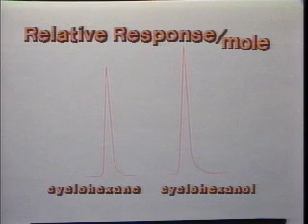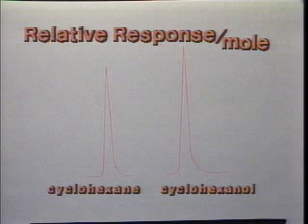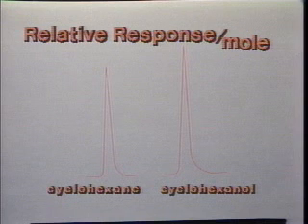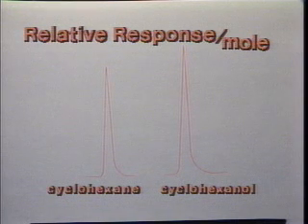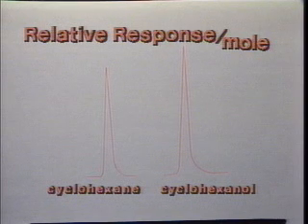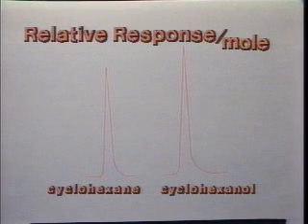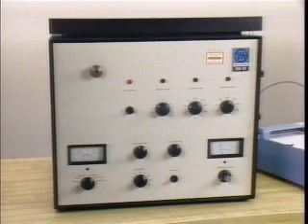Because many organic compounds have similar thermal conductivities, this correction factor is often negligible. However, for sample mixtures with components which have different kinds of elements, and thus different thermal conductivities, ignoring the correction can lead to errors of up to 20% in the calculation of the percentage composition of a mixture.